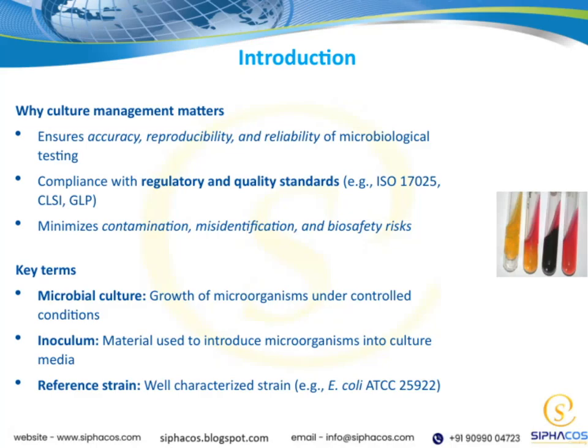Let's start with why culture management truly matters. Ensuring proper management of microbial cultures is essential because it directly impacts the accuracy, reproducibility, and reliability of microbiological testing. When cultures are handled correctly, the test results become trustworthy, which is critical for making informed decisions in our work. It also plays a key role in maintaining compliance with important regulatory and quality standards like ISO 17025, CLSI, and GLP. These standards help us ensure our processes meet industry expectations and legal requirements.